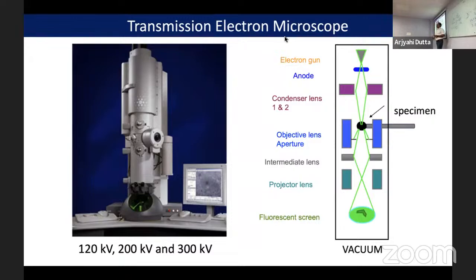There is another electron microscope, that is called the scanning electron microscope. In that scanning electron microscope, the electron beam will not transmit. It will just reflect from the surface and we will collect that. I'll come back to that point again. There is one electron called the backscattered electron, and we'll capture that backscattered electron. We'll capture that signal for the scanning electron microscope.